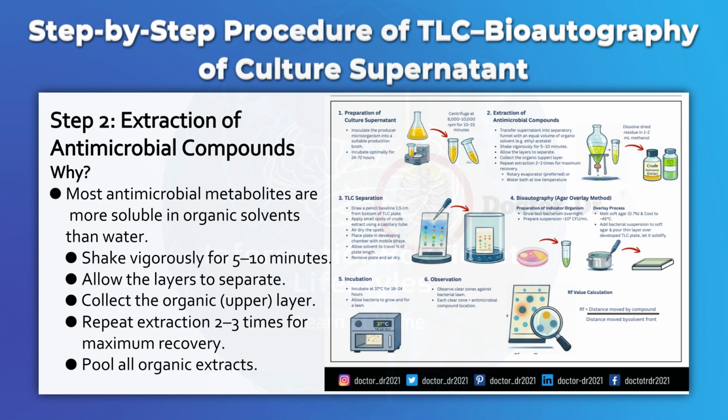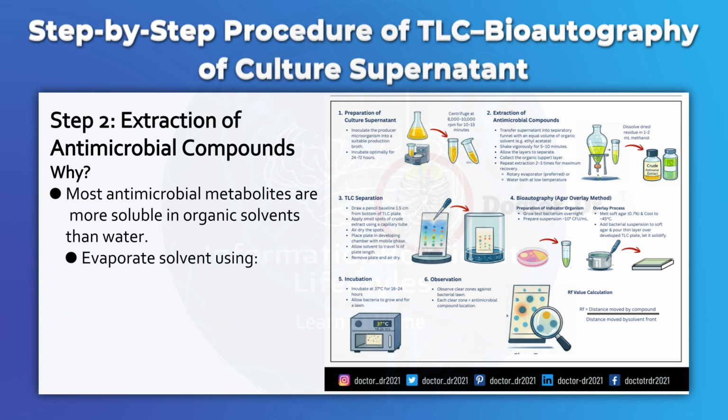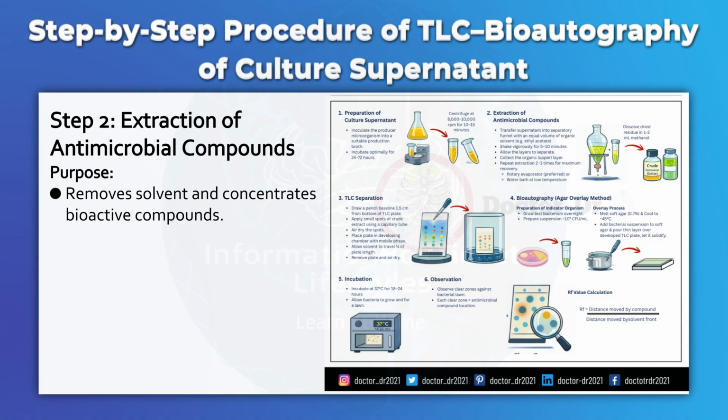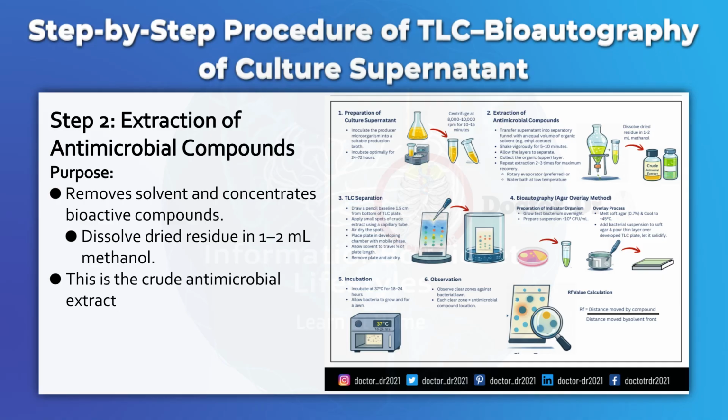Pool all organic extracts. Evaporate solvent using rotary evaporator, preferred, or water bath at low temperature. Purpose: removes solvent and concentrates bioactive compounds. Dissolve dried residue in 1 to 2 milliliters methanol. This is the crude antimicrobial extract.